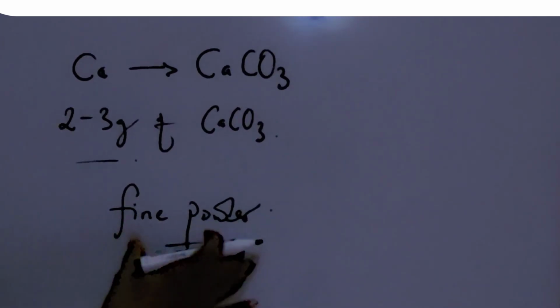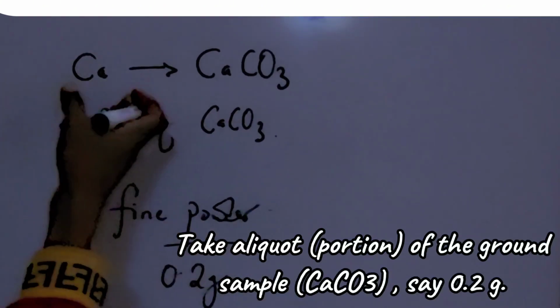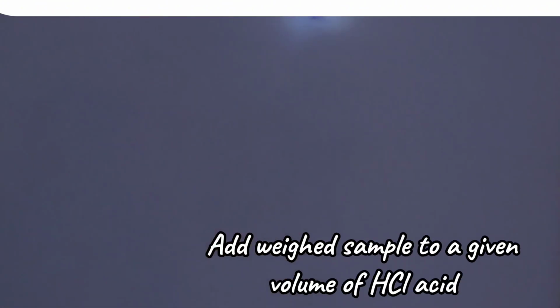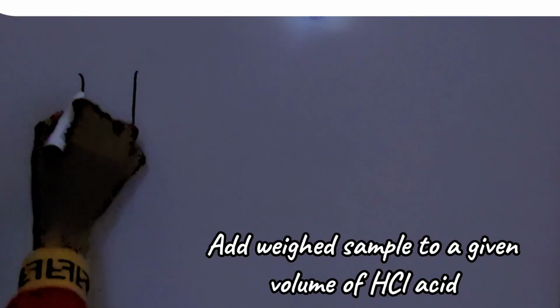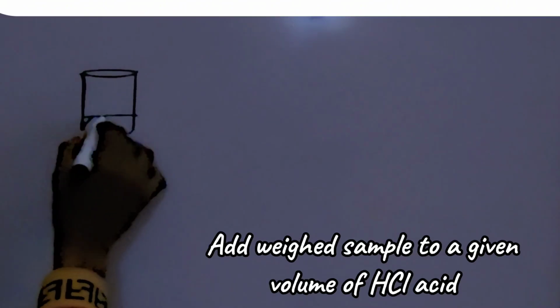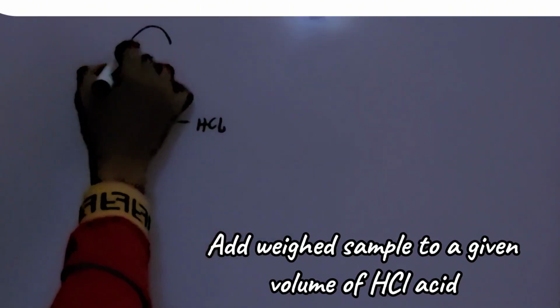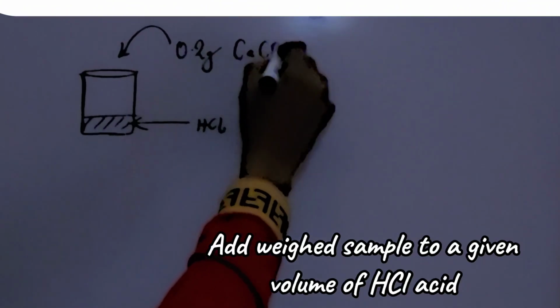Then you take some portion, let's say you take 0.2 gram of the fine powdered calcium carbonate. Once you've taken it, you would add this weighed amount into a given volume of HCl. The required volume is in your manual. So let's say this is a beaker and some volume of HCl is in it. You would add that weighed portion, let's say 0.2 gram of the calcium carbonate.